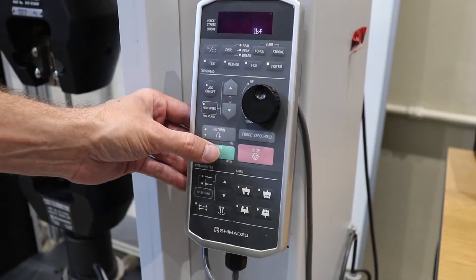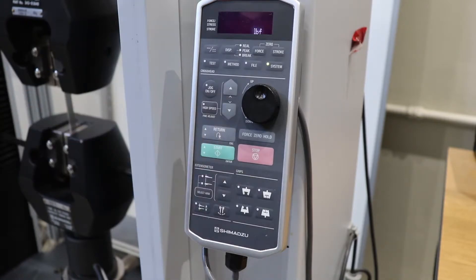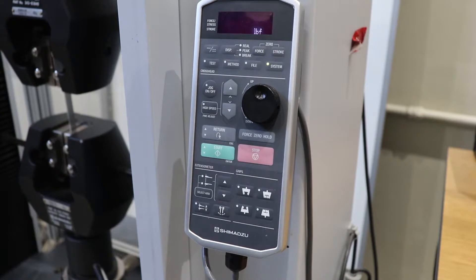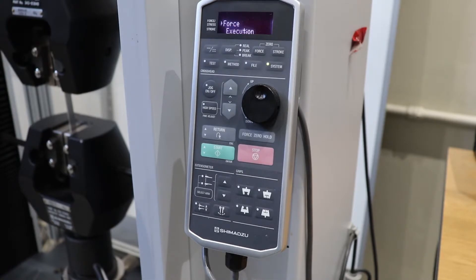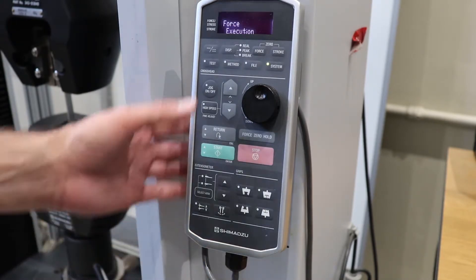This process takes a moment. Please be patient. Once the process is completed, force execution will show up on the screen. Simply press the test button.